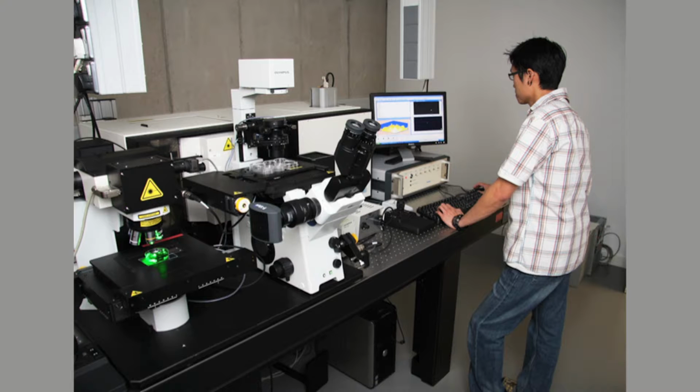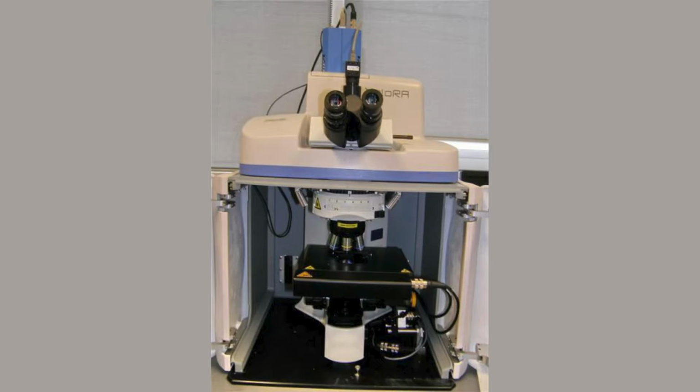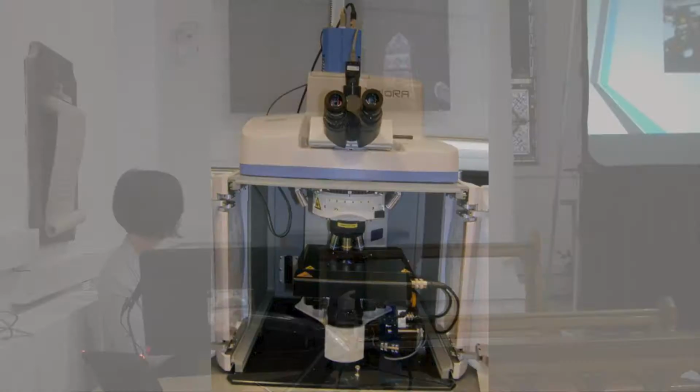And then in the lab also we have a couple of smaller systems, which is basically just a microscope with this box on top, which is where the spectrometer is. So this is, let's say, a more user-friendly, more simple kind of system that we're using for our biophotonics applications.